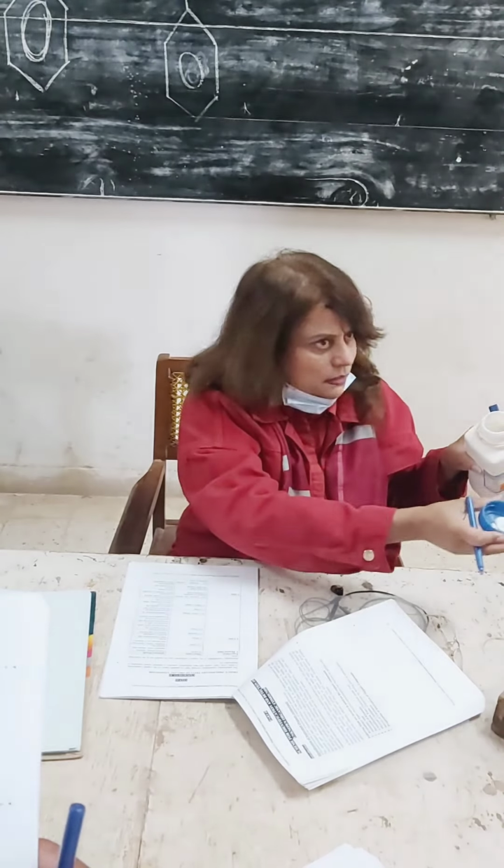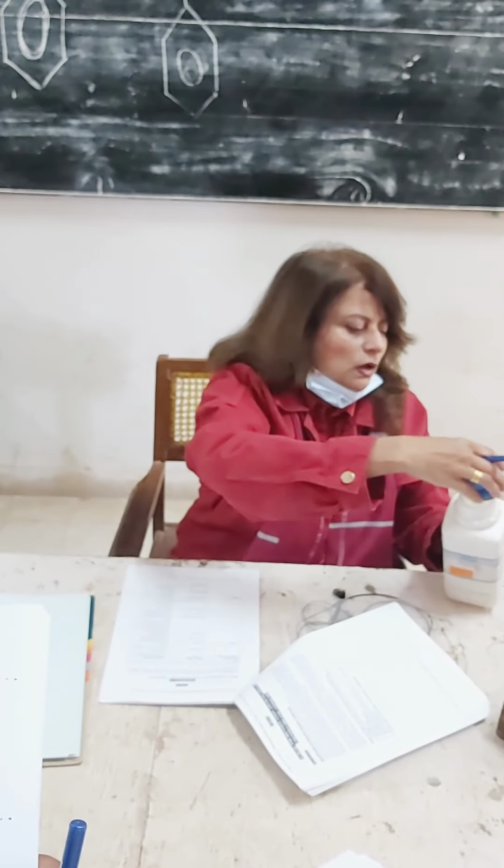Do you understand? It is solid, so we will keep it in the solid state. And we are going to use these, the things which you are going to need.